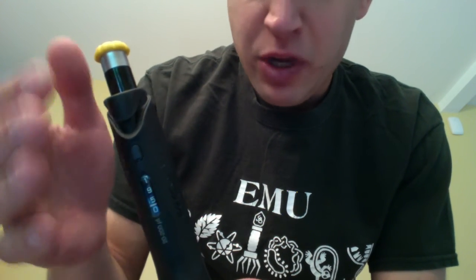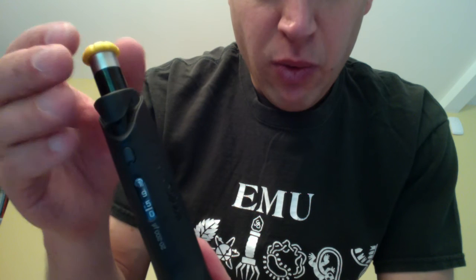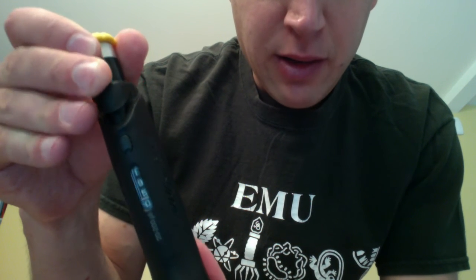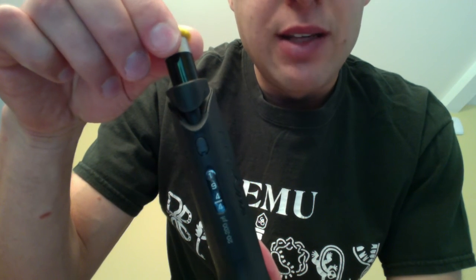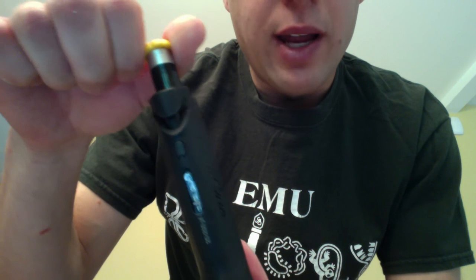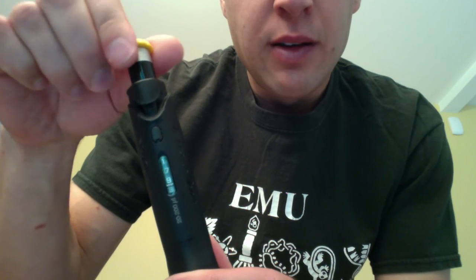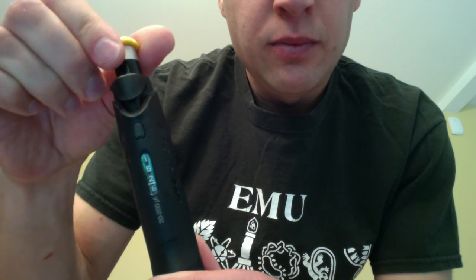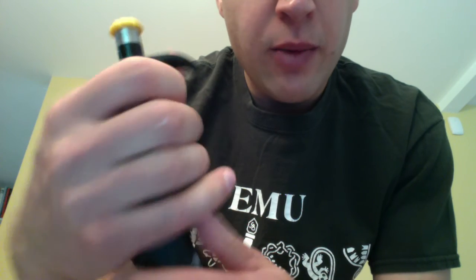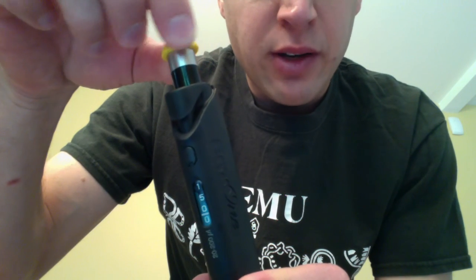This is a nice feature, because when you're pipetting you could accidentally twist the button and change the volume — but not with these Ergo ones. To unlock the volume setting, just pull up gently on the button until it snaps — don't tear it off, just do it gently. Then, if you want to decrease the volume, turn it clockwise; if you want to increase the volume, turn it counterclockwise. I'm going to turn it clockwise until the display reads 150. There we go — perfect. Then lock it in by pressing down on the button. Now it's set to deliver 150 microliters and you can see it's locked; the volume is not changing.